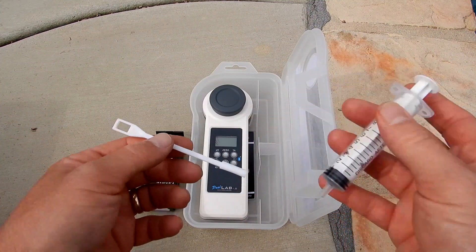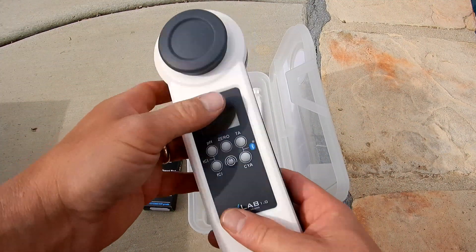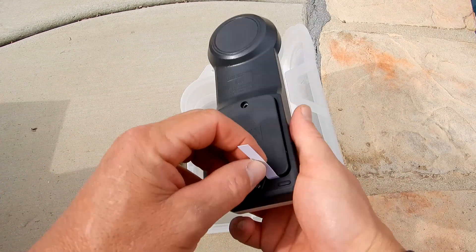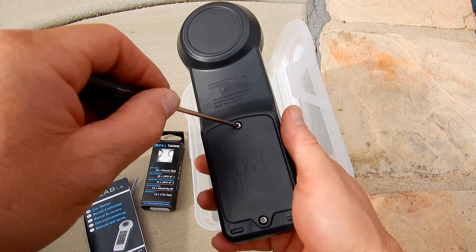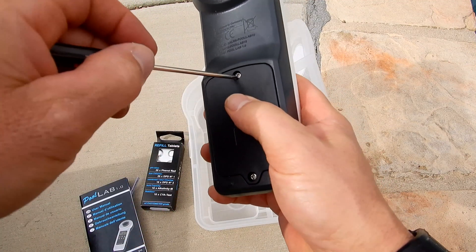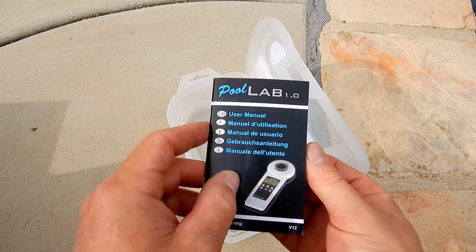It also comes with a syringe and a stirrer to break up the tablet. The unit itself comes with batteries — you just have to take the tab out and tighten up the battery chamber, so all you need is a small Phillips screwdriver. Make sure both screws are tight. Also included is a user manual in multiple languages.